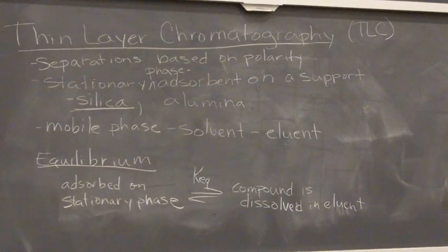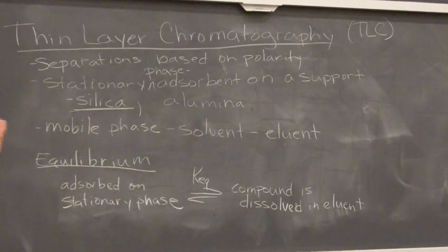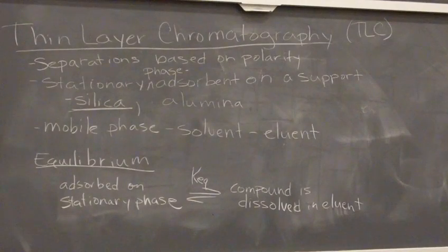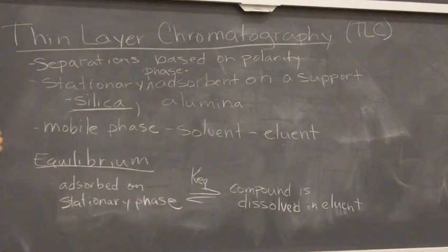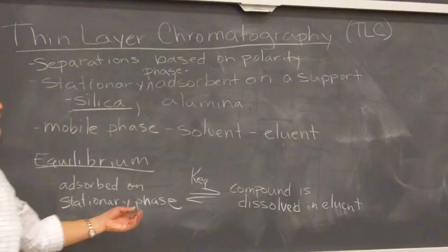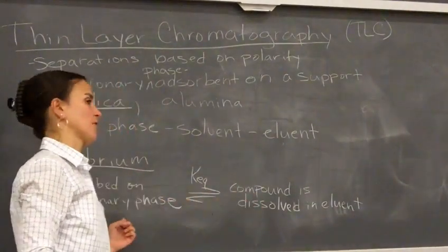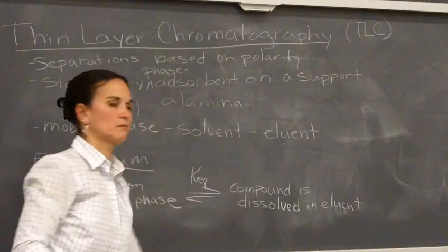Yeah? What is the difference between adsorbent and absorbent? Adsorbent has to do with the process of it actually interacting with the silica, and that's called adsorbing, just as absorbing. So it's not absorbing into the silica and staying there, it's still going back and forth. Even though it wants to hang with the silica more, it's still doing this back and forth. It's just hanging over here more than over here.